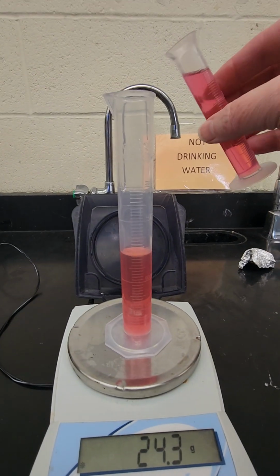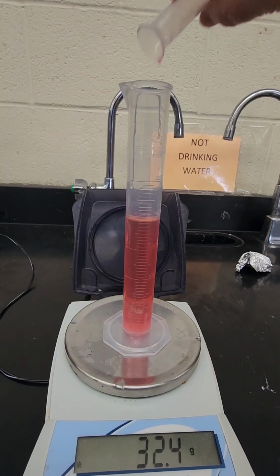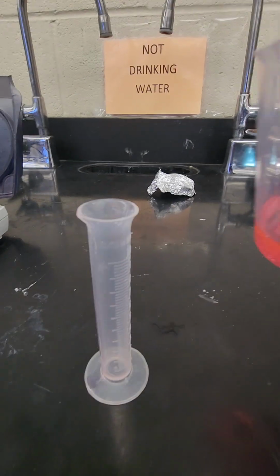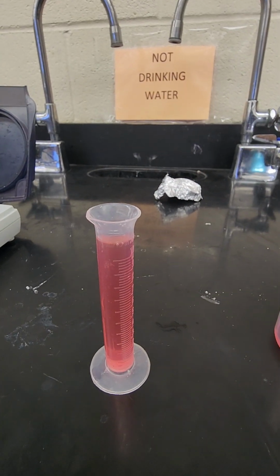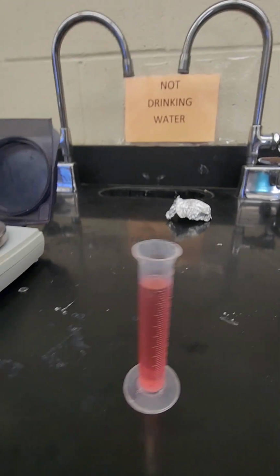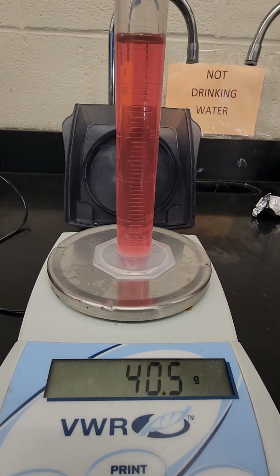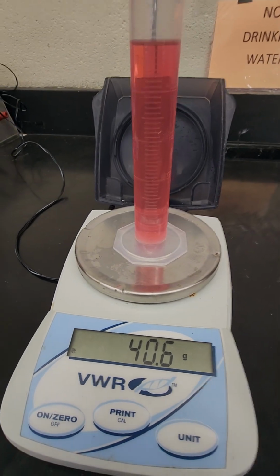And so now we're at 40 milliliters, and the mass is 32.4. Now I'm going to do it one last time so I can have a total of 50 milliliters. A little bit too much, so I need to take some out. And again, this is 50 milliliters for a mass of 40.6 grams.